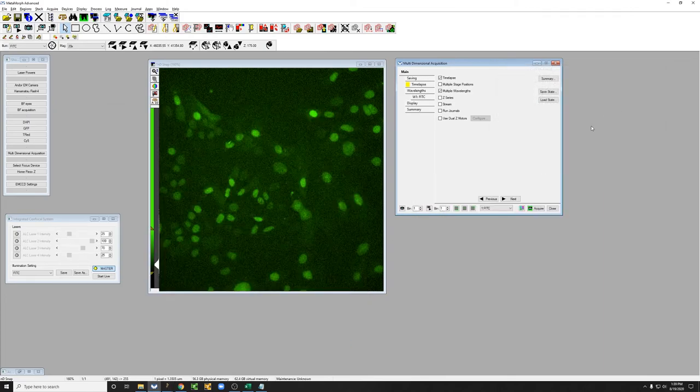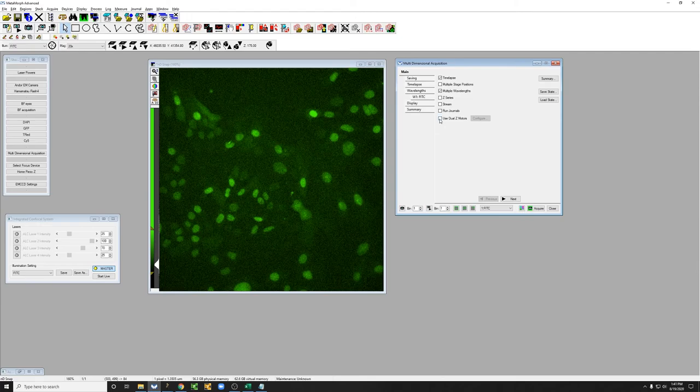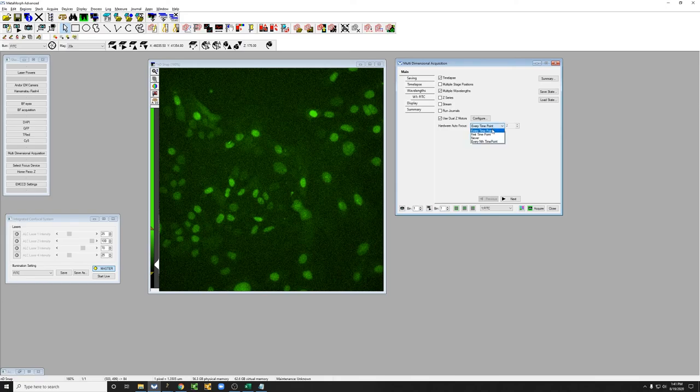So how do we engage the hardware autofocus in Metamorph? The way to do that is to click here where it says use dual Z motors. And then in hardware autofocus we're going to say we want to do this every time point. So we're going to check and make sure the focus is correct for every time point.